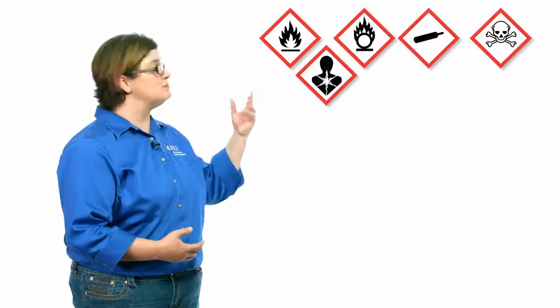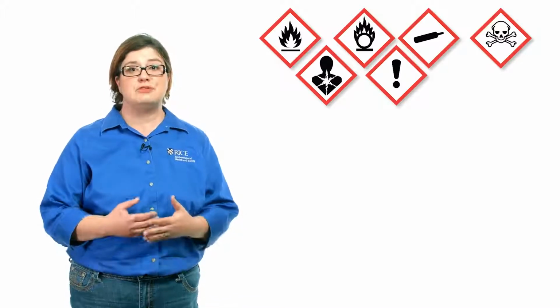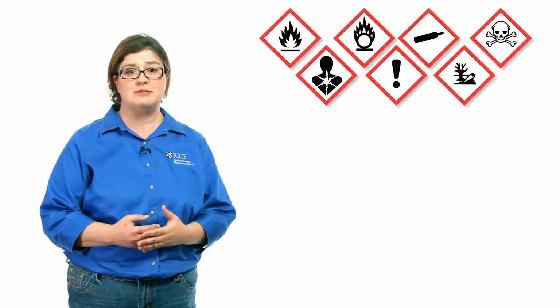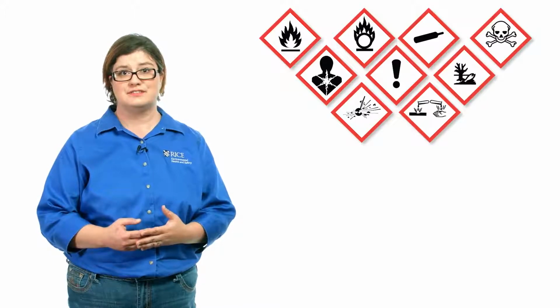And then we also have the symbol for long-term health hazards. The exclamation point represents general health warnings. And then we also have the symbol for toxic to aquatic life or the environment. Last, we have explosives and corrosives.